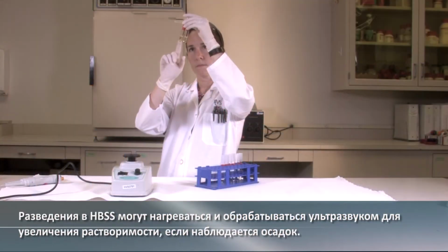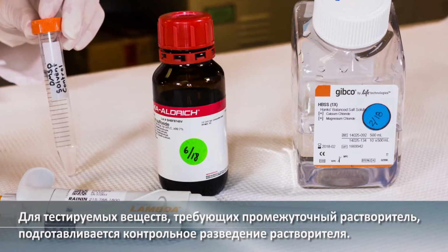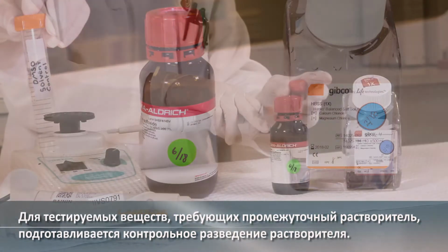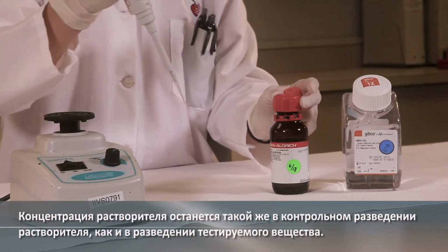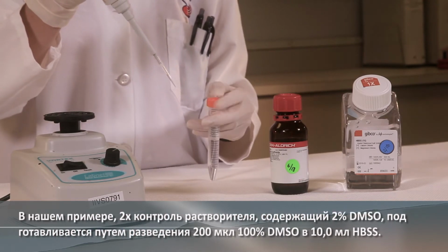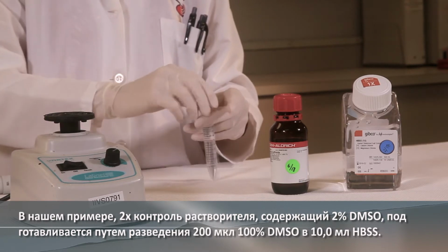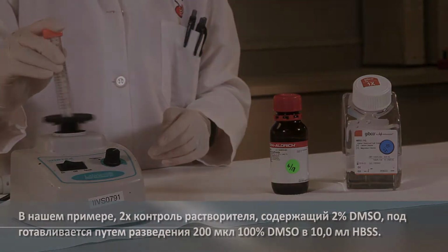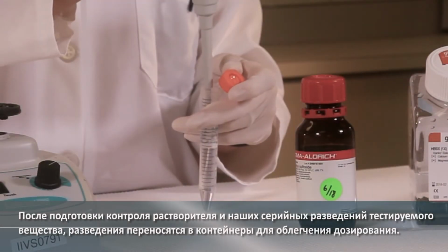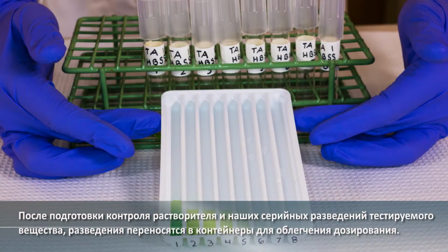The dilutions in HBSS may be heated and sonicated to increase solubility if precipitates are observed. For test articles requiring an intermediate solvent, a solvent control dilution is prepared. The concentration of solvent will remain the same in the solvent control as in the test substance dilutions. In our example, a 2x solvent control containing 2% DMSO is prepared by diluting 200 microliters of 100% DMSO into 10 milliliters of HBSS. Once we've prepared the solvent control and our serial dilutions of the test substance, the dilutions are transferred to reservoirs to facilitate dosing.